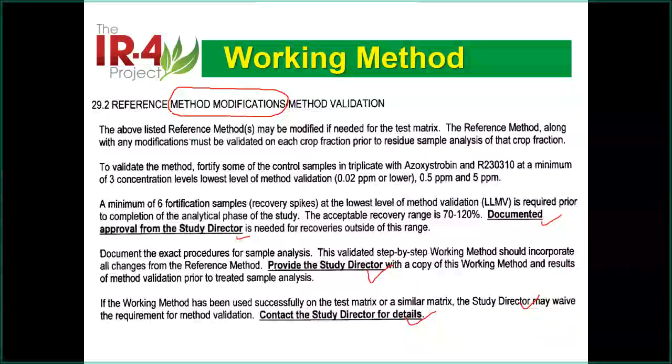So in this case, any change, this is going to be a very big question now. It can be a very small change, or it can be a very big change. So if it is a big change, it may not be good. If it is a small change, that's okay because you are not the same as other labs. Of course, most likely the high levels are okay, but what is very difficult is the LLMV level. So here's the thing. When you talk to the study director, say, okay, I make the change, I talk to the study director, these are the good results.